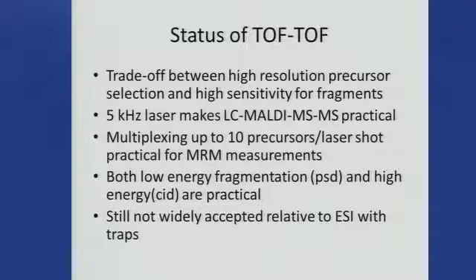And I have to say that the present status is there are a number of commercial instruments out there, they work, people are using them, but it's not as widely accepted relative to electrospray with traps as some of the other MALDI techniques are. And that's partly because electrospray with various traps works extremely well, and people tend to use whatever they have that works well. But TOF does have a role to play, I believe, but it's not as prominent as it might be.